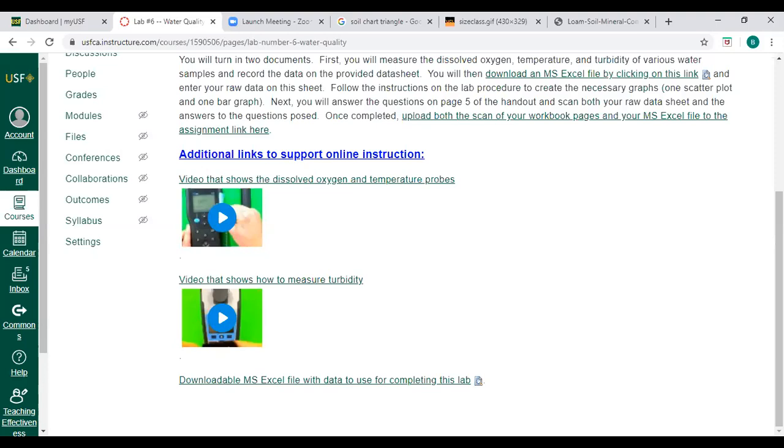So as you'll see, sand, silt, and clay are all going to have extremely different NTUs after this. They're all going to be very high immediately after, but once you give them time to settle, they will rebound more quickly. Sand will rebound a lot quicker. It'll be a lot clearer. Clay will still be extremely high. Clay usually takes about a day to settle just because it is so hard to have those particles fall out of suspension because they weigh practically nothing. That's the main part of this whole turbidity.